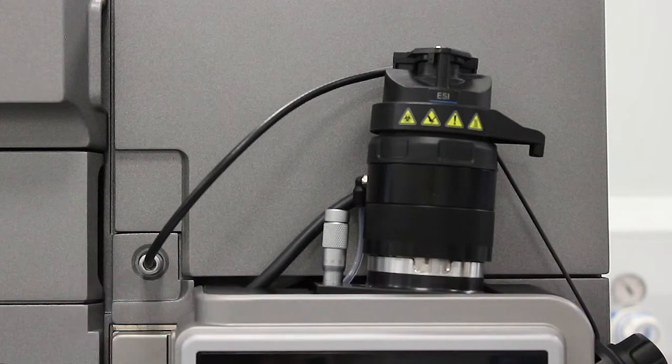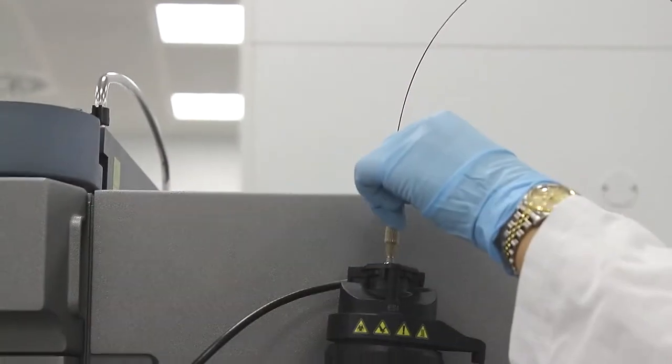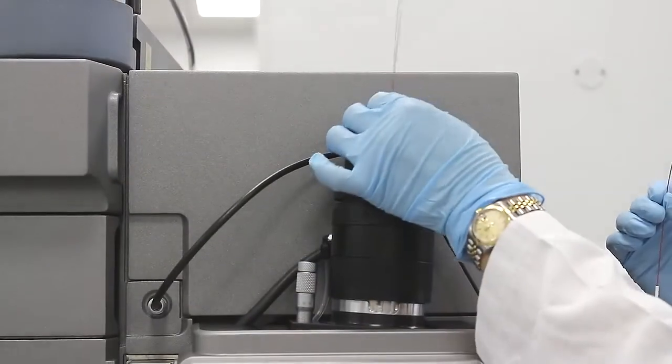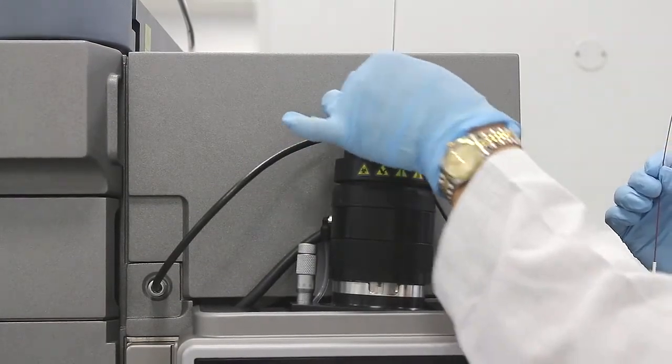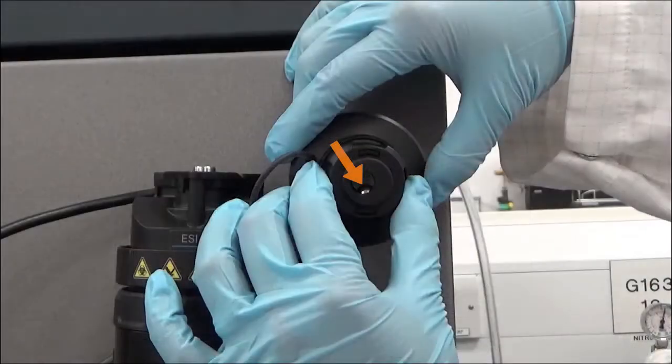To install the probe assembly, remove the cap and then install the probe assembly into the probe adapter. Finger tighten the PEEK fitting into the probe adapter until it clicks to form a seal.